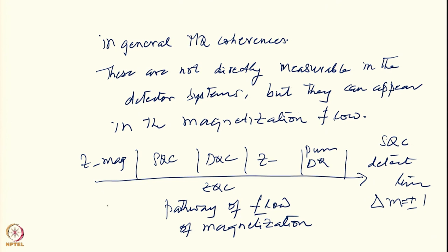You can use different kinds of nuclei, generate different kinds of coherences in this experiment. And then I will have terms such as 2IKZILZ. I will also have such kind of terms, and this is called 2 spin ZZ order.